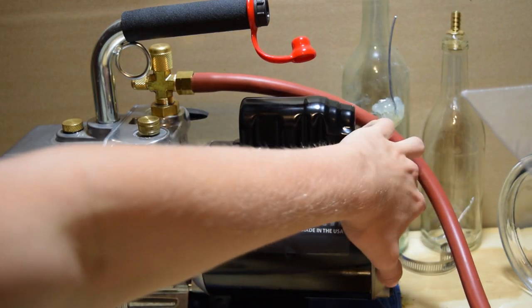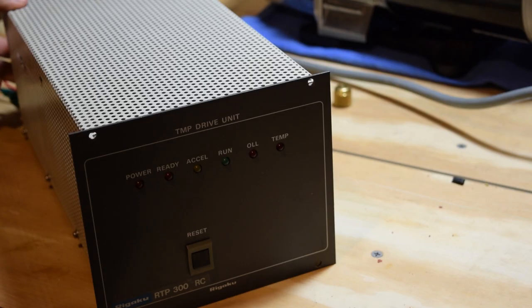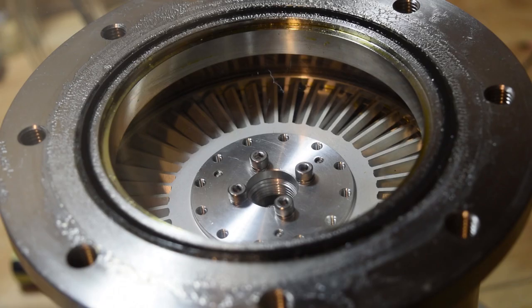This video wouldn't be complete without me showing you a run of the pump. The first thing to do is to turn on the roughing pump and the drive unit. Once the correct pressure is reached I can turn on the acceleration switch. When this is done you can see the ready light turns off and the acceleration light comes on.